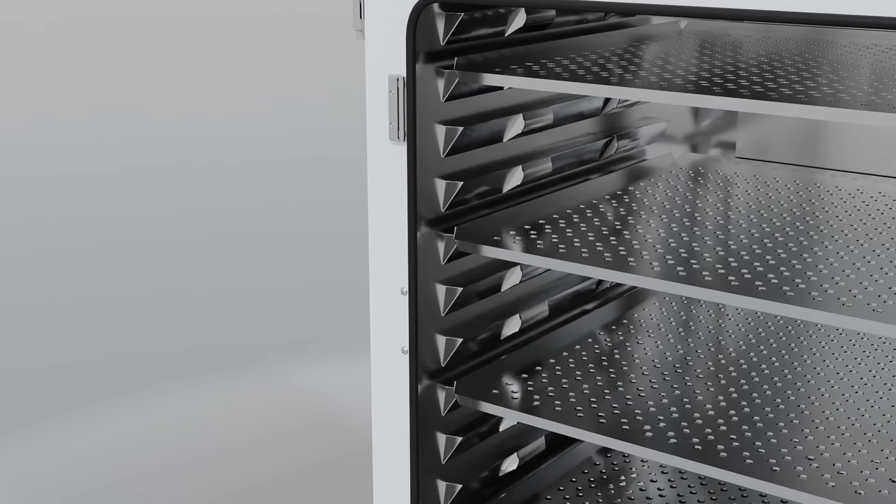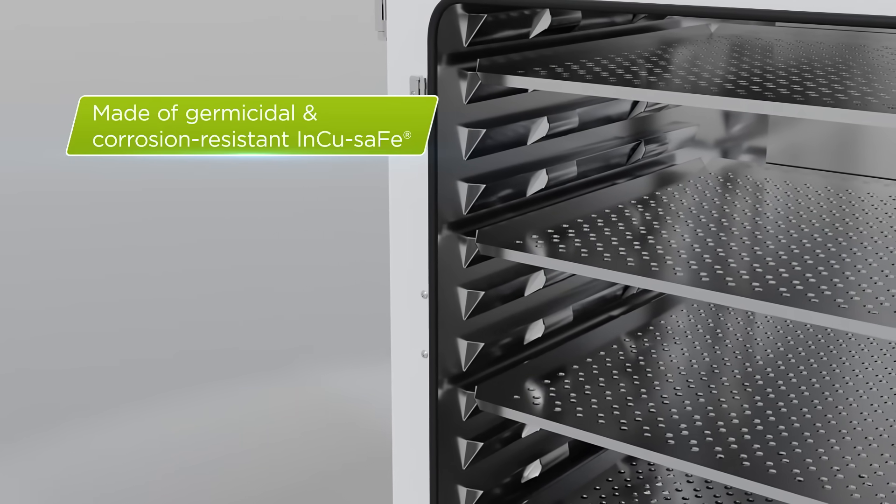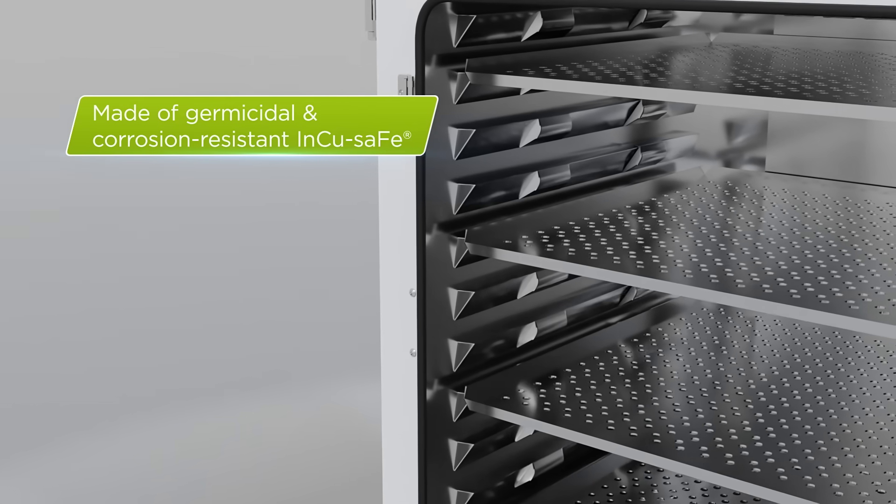The interior is made of Incusafe, a material that combines the germicidal properties of copper with the corrosion resistance of stainless steel.